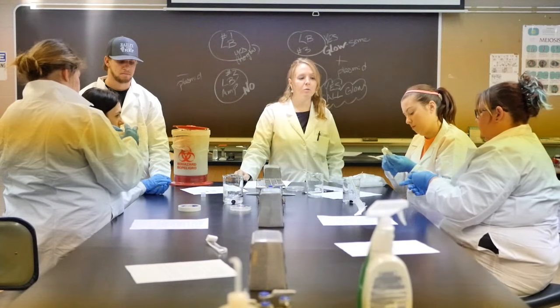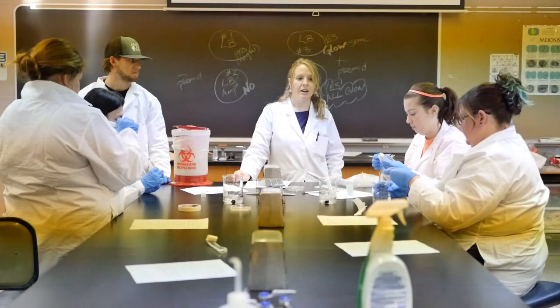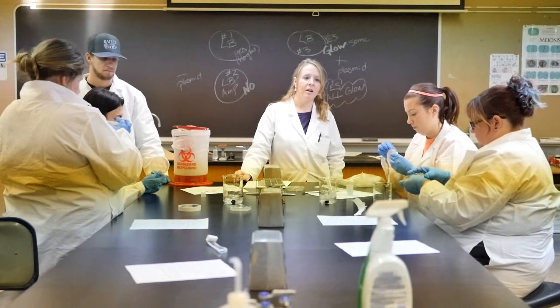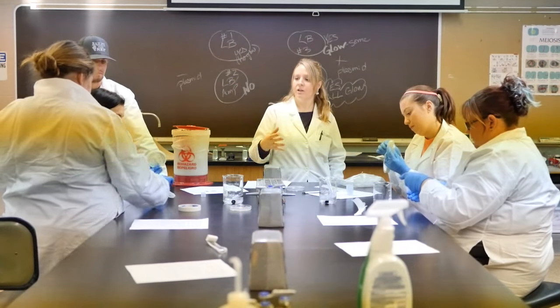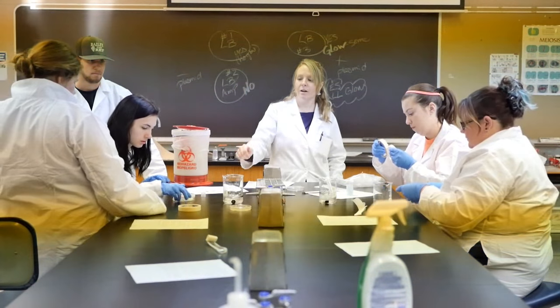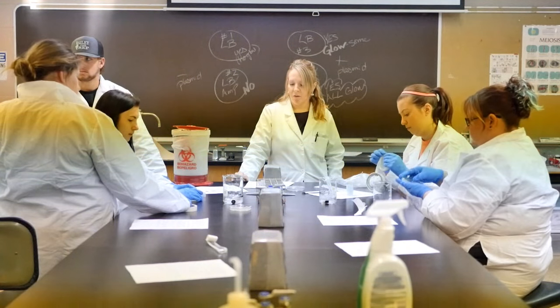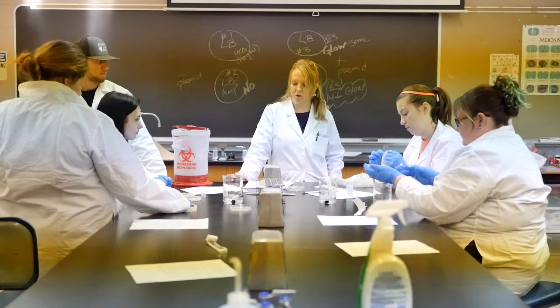So these will be incubated upside down. Being incubated upside down makes sure that there isn't any condensation on the lid that would drip down and distort the colonies. They get incubated in the 30-degree incubator, which is in the left corner. The optimal period of time at that temperature is 48 hours.